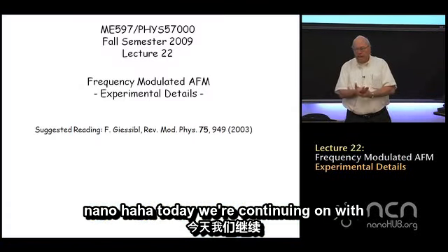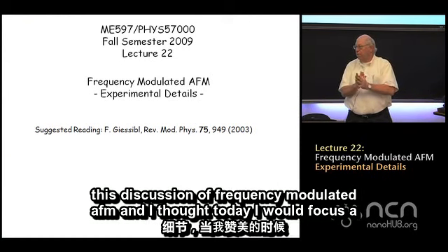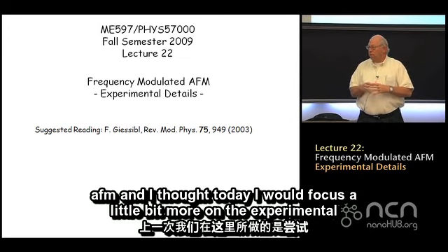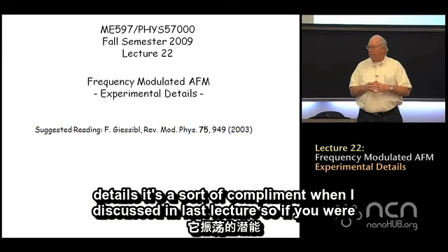Today we're continuing on with this discussion of frequency modulated AFM. And I thought today I would focus a little bit more on the experimental details to sort of complement what I discussed in last lecture.